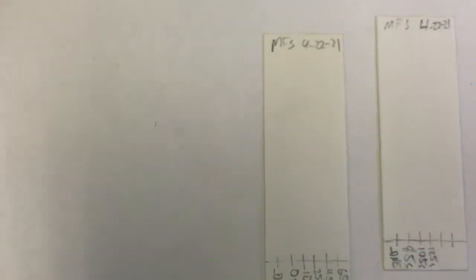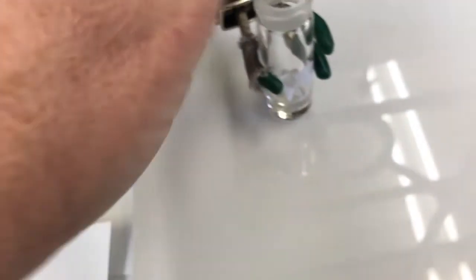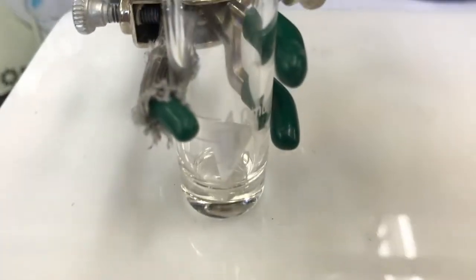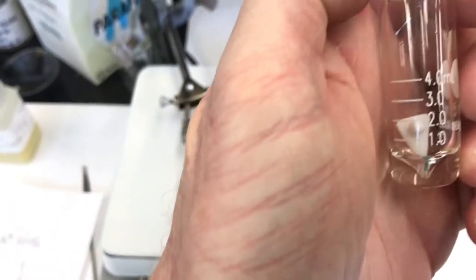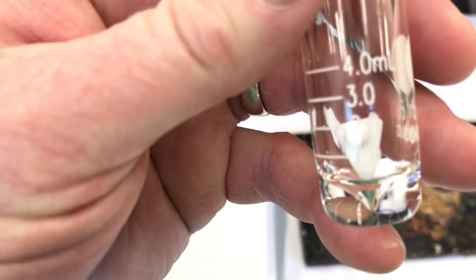The way that will work is it'll be before I've added sodium borohydride. What I'm going to do is over here in this little 5 ml conical vial, twist it around so you can see the graduations. Yeah, this is a 5 ml conical vial I have on this stir plate. It's hard to read. There you go. This is a 5 ml conical vial. See how it goes to 4 milliliters? I don't understand why they do that, but this is a 5 ml. Because it can go up above 4 to 5, but it doesn't have a graduation for 5. I don't get it. But anyways, this is what we're going to use to run our reaction. It has this thing called a spin vane in there. I'll show you what that is.